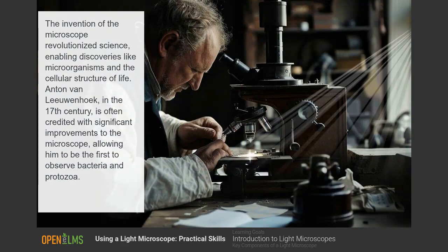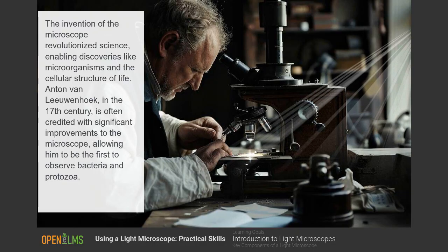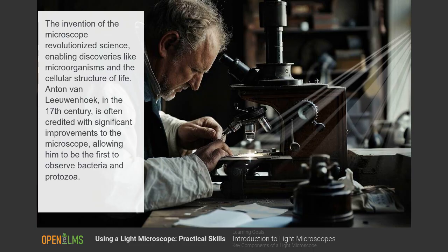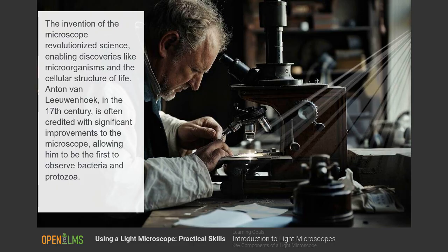The invention of the microscope revolutionized science, enabling discoveries like microorganisms and the cellular structure of life. Anton van Leeuwenhoek in the 17th century is often credited with significant improvements to the microscope, allowing him to be the first to observe bacteria and protozoa.